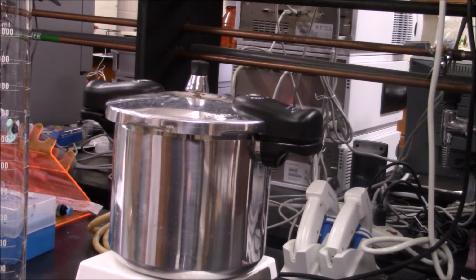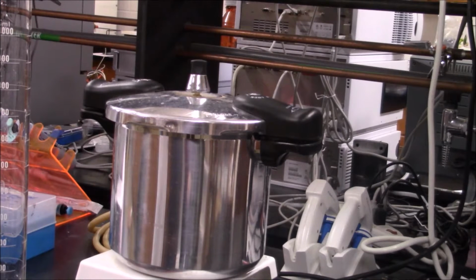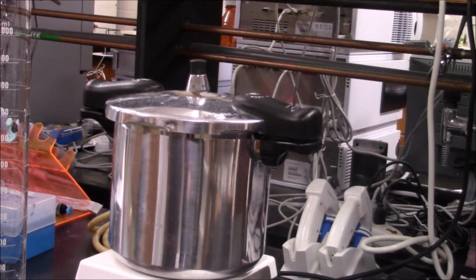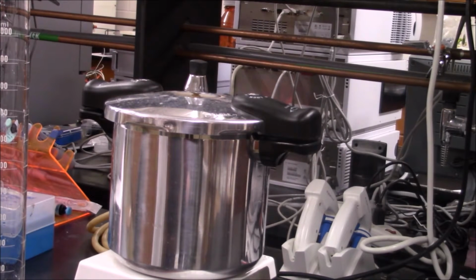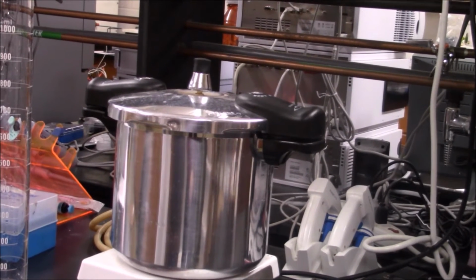The water has reached a boil once the safety valve, the knob on the top of the pressure cooker, begins to rock gently. At this time, the temperature should be reduced slightly and the flasks should be left in the pressure cooker for 20 minutes. Watch the safety valve to ensure that it continues to rock gently, adjusting the temperature as necessary.